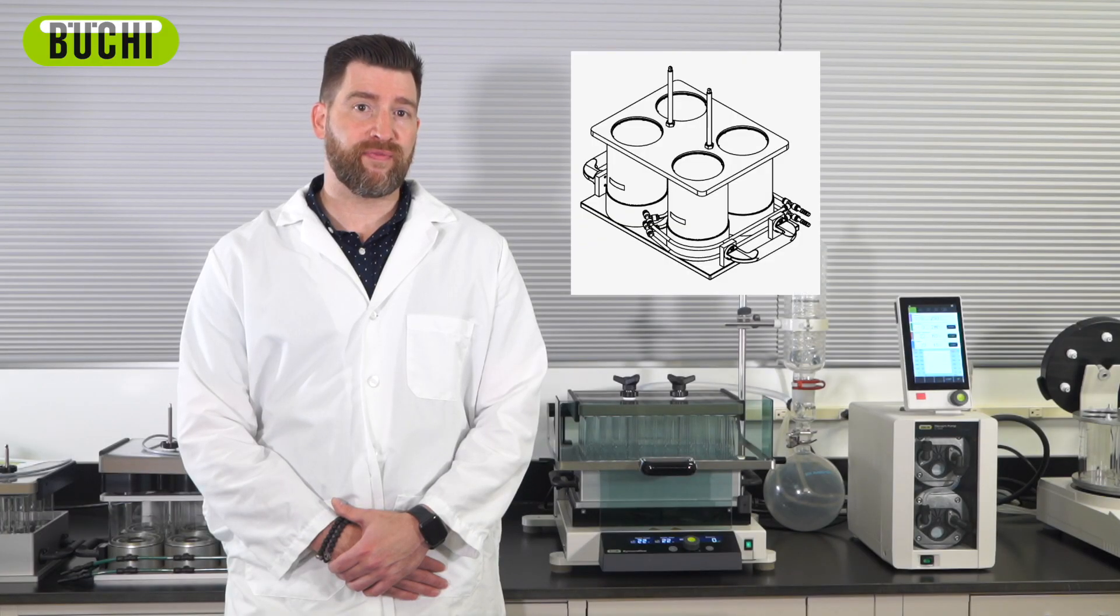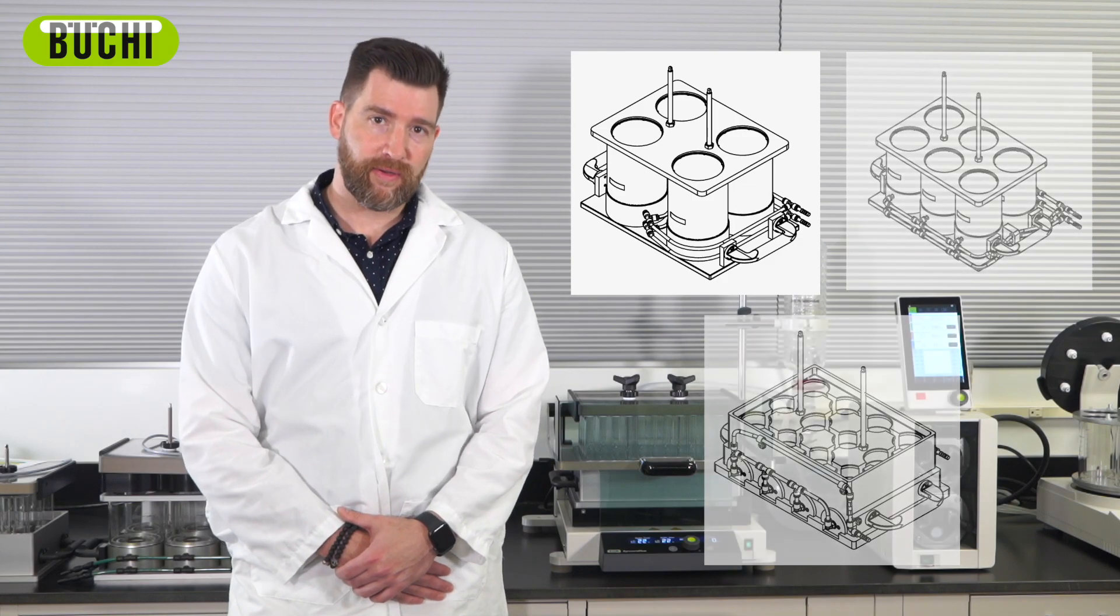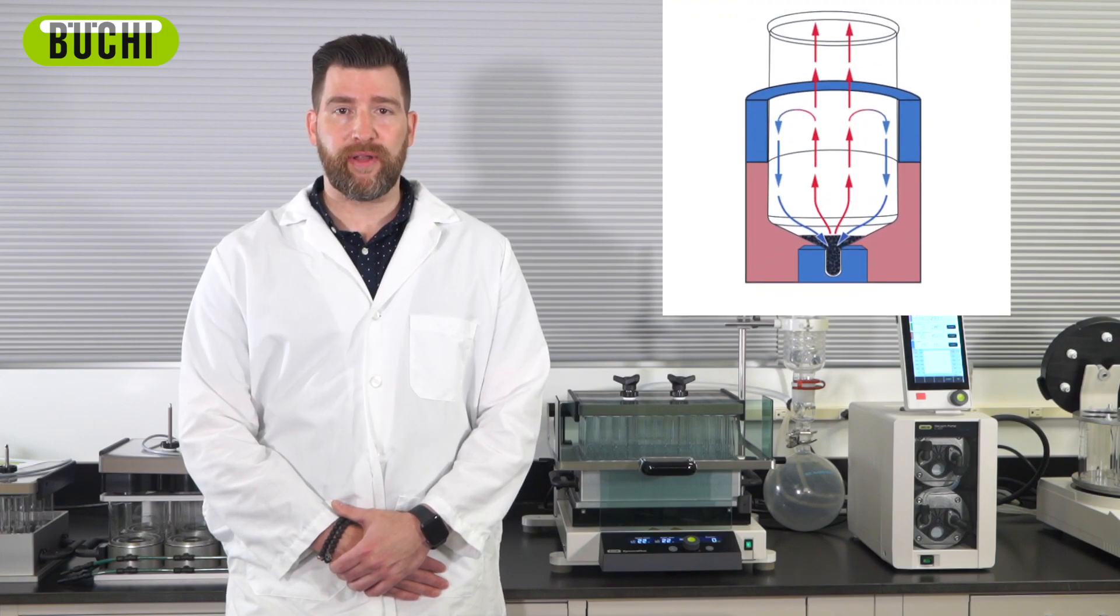This unit comes in 4, 6, and 12 positions, for volumes ranging up to 500 milliliters per container. You'll notice a unique Analyst accessory called the Flushback Module. This improves analyte recovery by reflexing condensed solvent against the walls of the glassware.